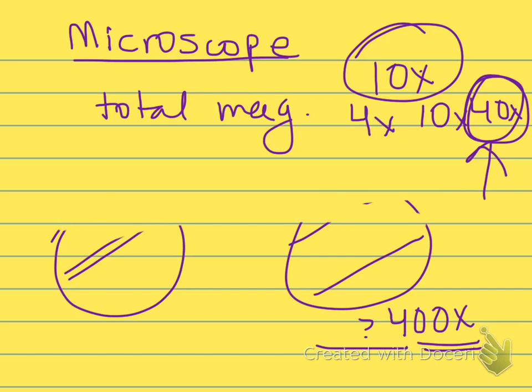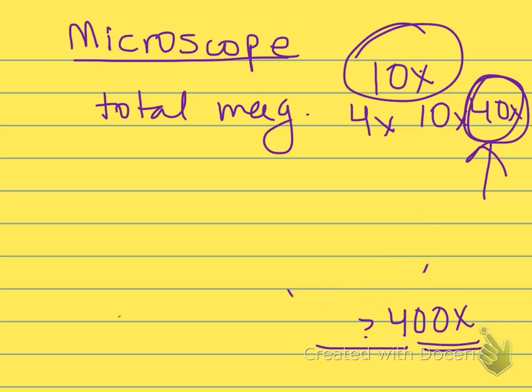The next thing, let's erase this here. The next thing you need to know about the microscope is a couple of different parts.